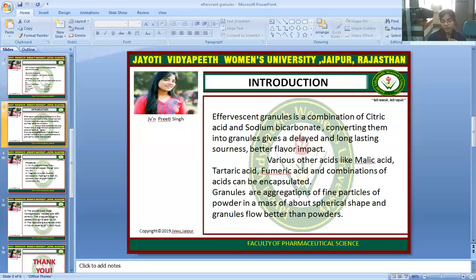The most popular compound granulation is the effervescent powder, sometimes called effervescent salts, because citric acid and tartaric acid are also mixed in this preparation. In heating the dish, the powder added to it will heat up slowly, and the liberated water of crystallization will go on.